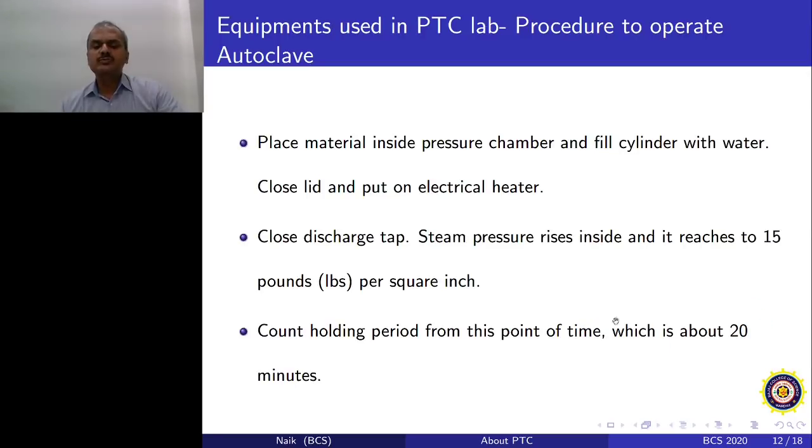Now generally, if the volume of the medium is very large, let's say if you are having Magenta bottles, or a conical flask of say 200 milliliter where you have 100 milliliter of media or more, then whenever you have a larger volume in one single vessel, you should have maybe 25 to 30 minutes of autoclaving time. That time is important because if the volume is large, then you require a longer time to ensure that you don't get contamination at all.